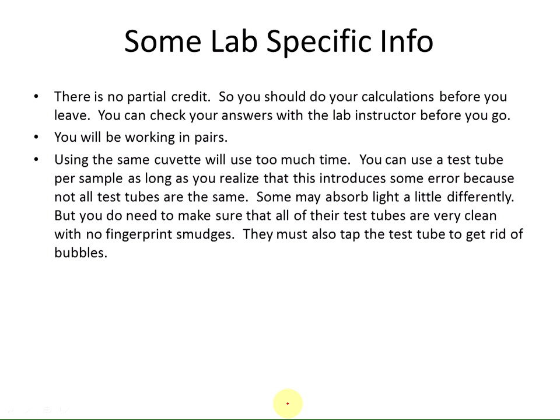But you do need to make sure that all the test tubes are very clean with no fingerprint smudges when you take your measurements. Also, if you have any air bubbles in your samples, those air bubbles will interfere with the absorbance, so make sure you lightly tap it to dislodge the air bubbles.